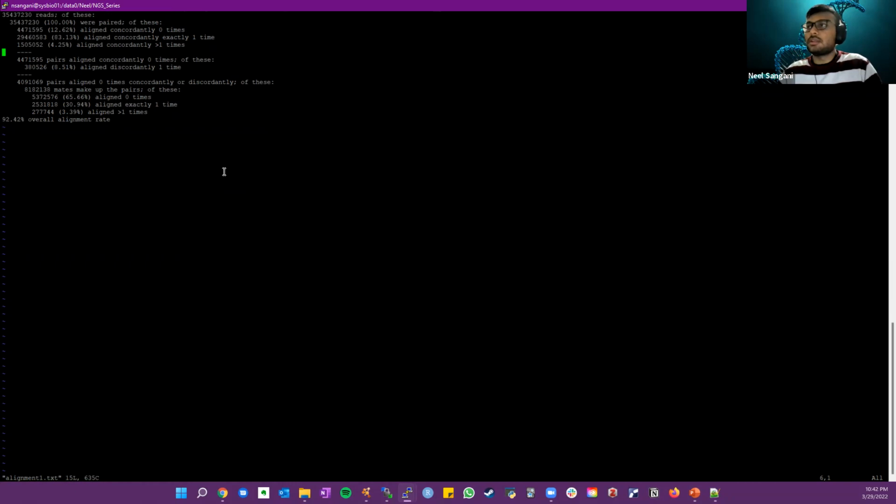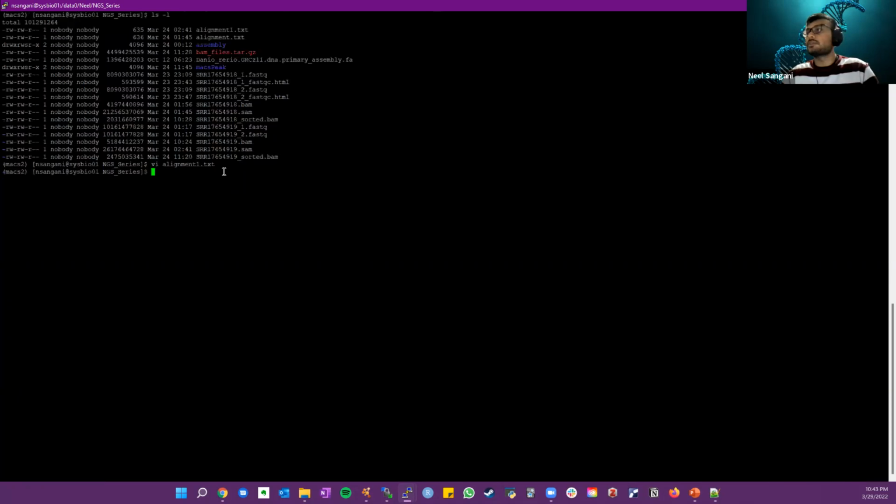In this alignment job, we get an alignment of 92%, which is really good. This also gives us detail of how many reads align more than one time, exactly one time, zero times, etc. So you can look into the details here if interested.